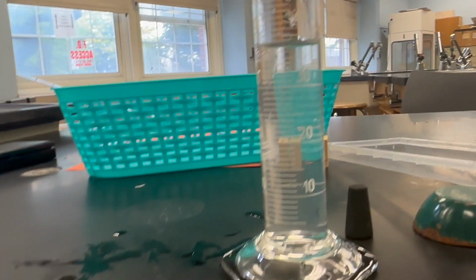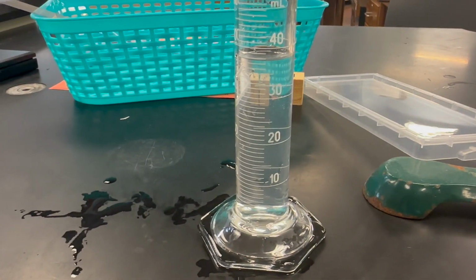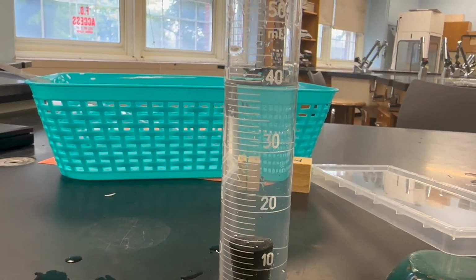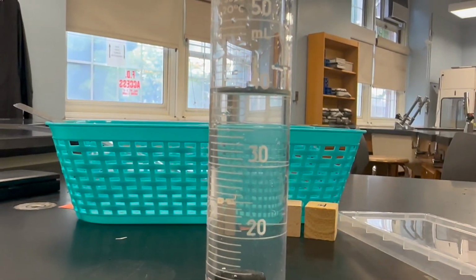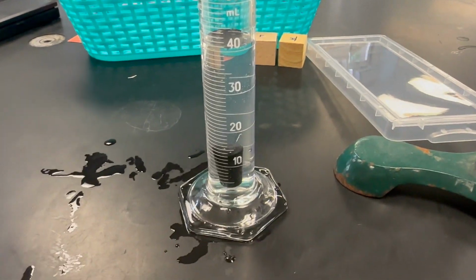So we're going to record that as our initial. Again, you may have a different initial, that is totally okay, because it matters how much the water changes, not what the initial or final volume specifically is. So we're going to take our stopper and drop it in there. And so now our water level rose to about 41 milliliters. And so we're going to use that as our final volume. So then once that's done, we can do final minus initial to get the volume of our stopper.